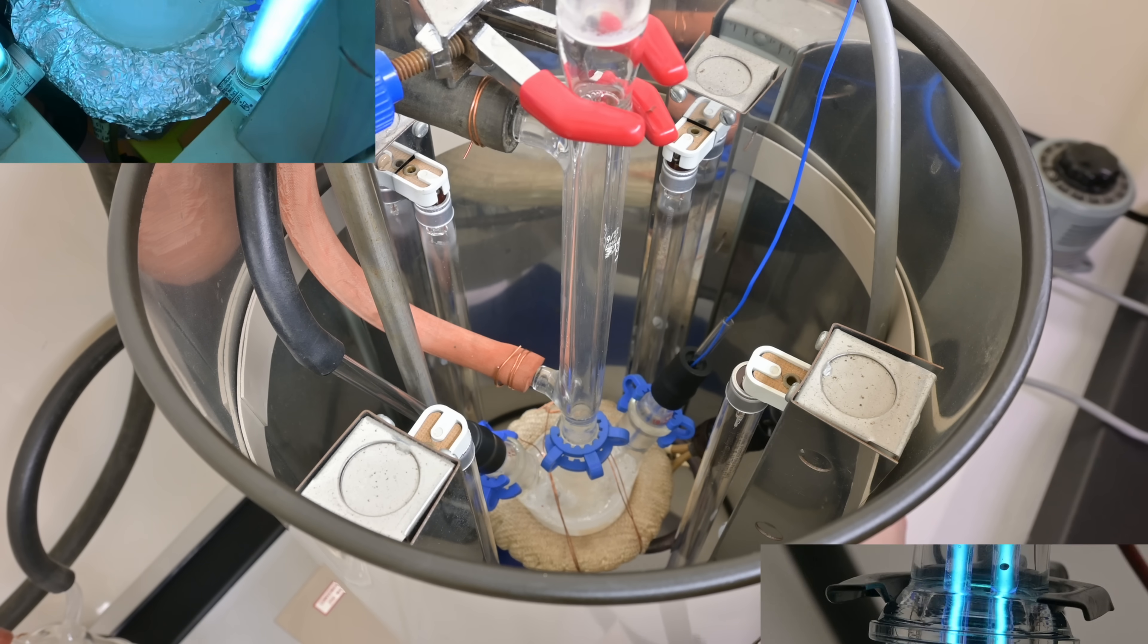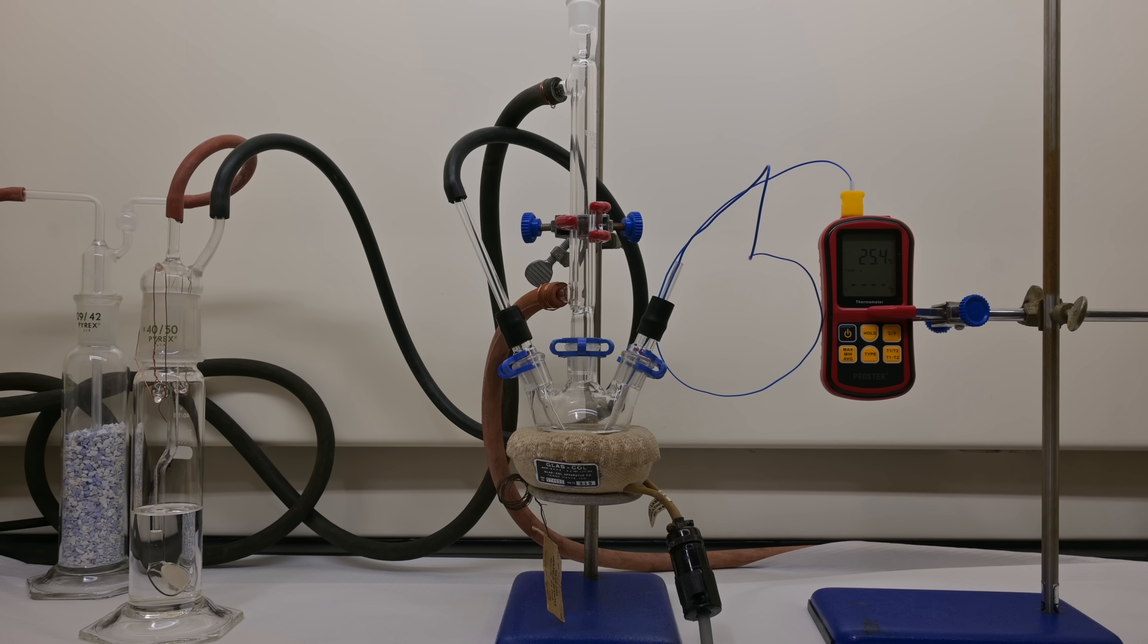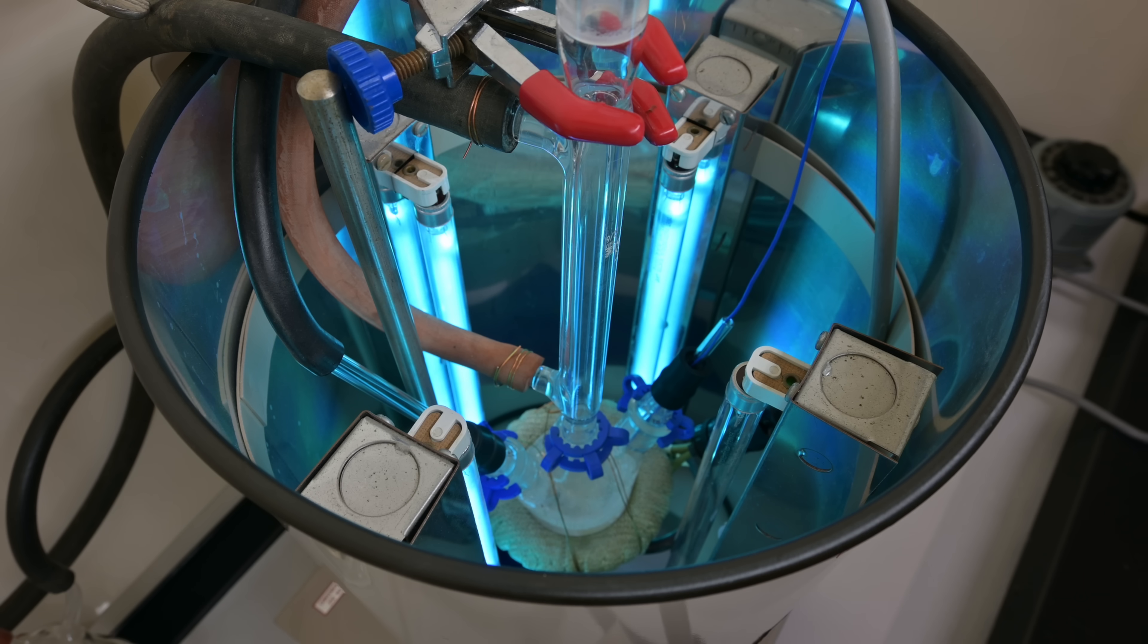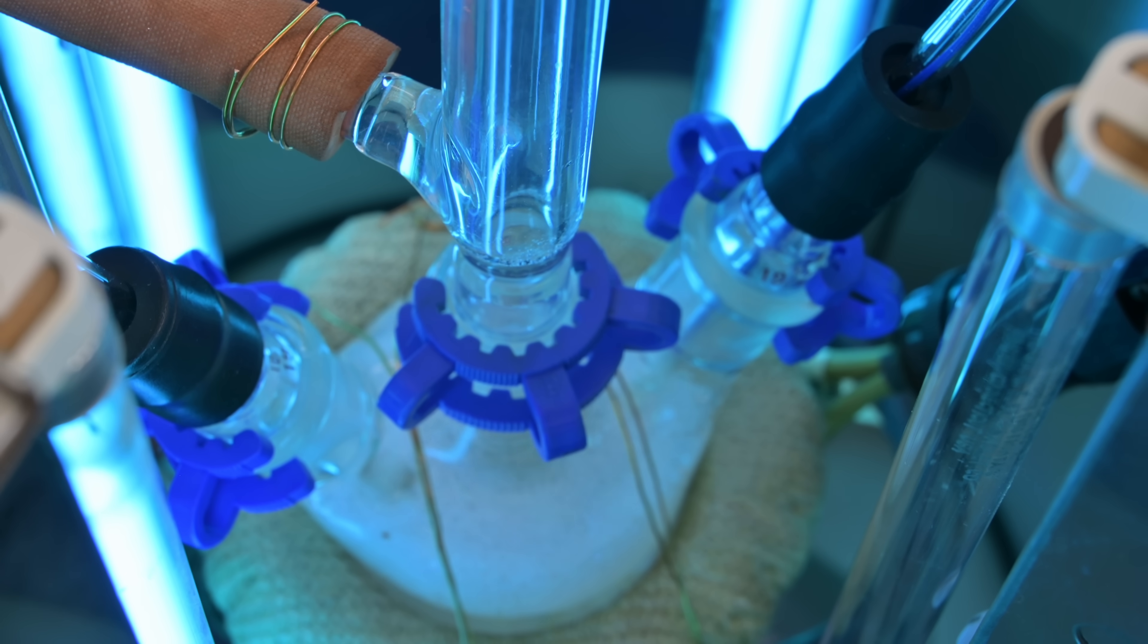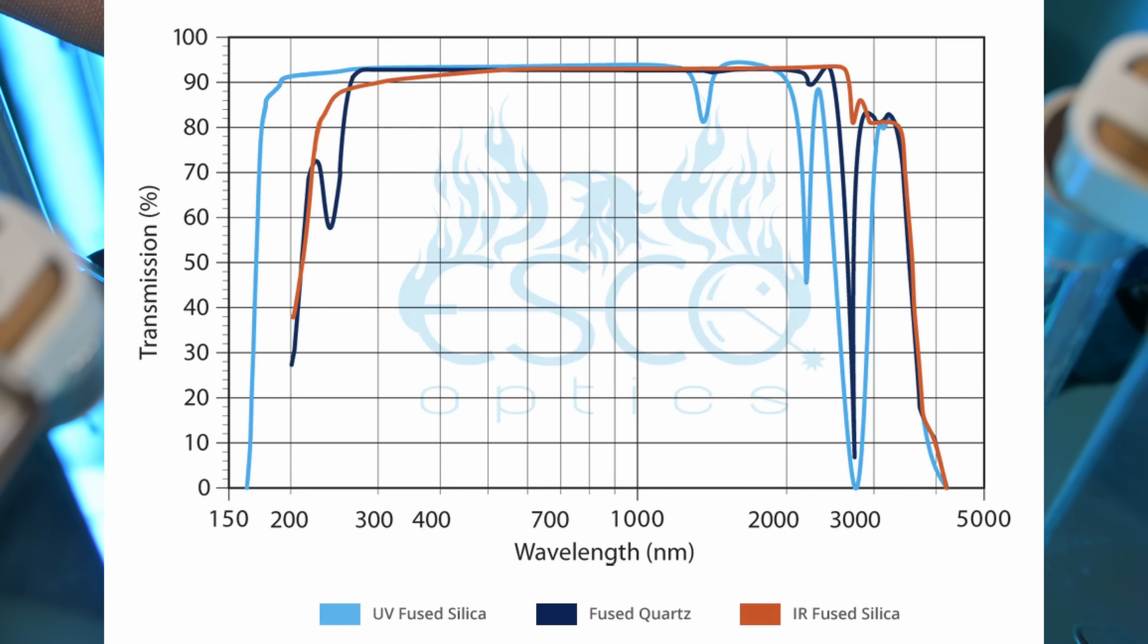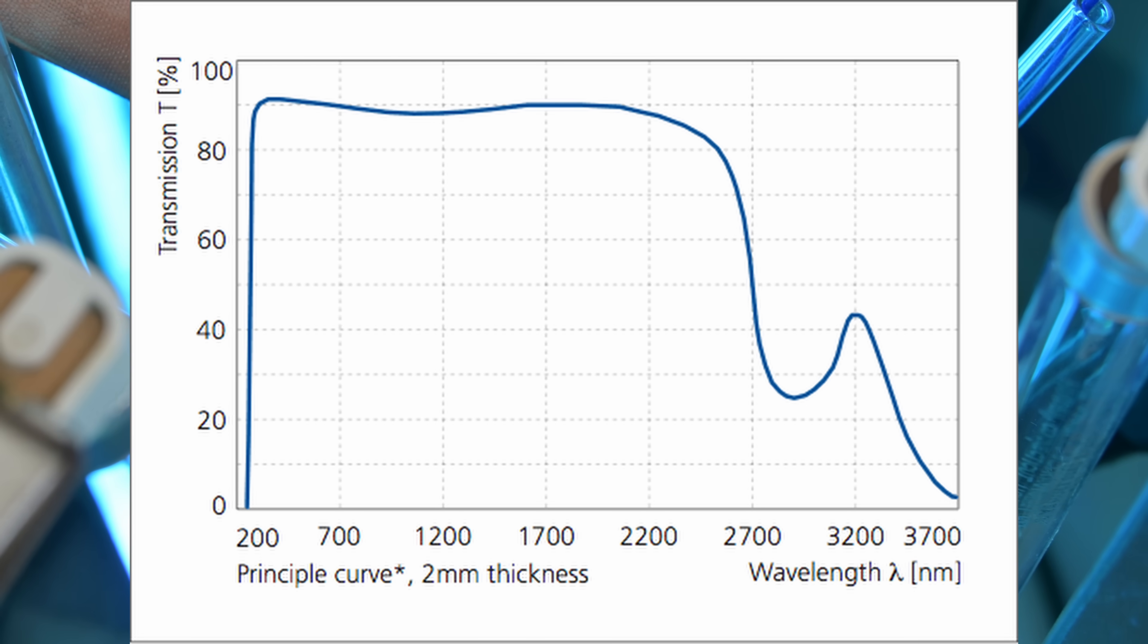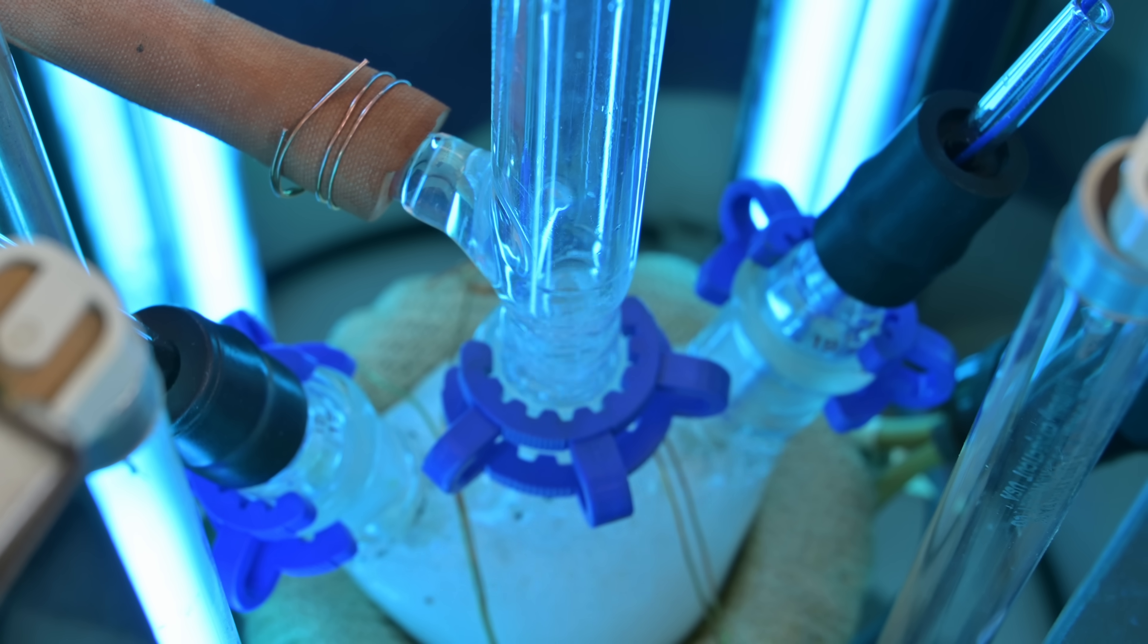I ended up having to attempt this reaction three times to finally get a successful run with a setup that worked well. In my first attempt, I used a three neck flask within a photochemical reactor. The photochemical reactor produces UV light which supplies the energy to create the radicals of chlorine. The problem occurs here is that I don't have quartz glass flasks. I only have borosilicate.